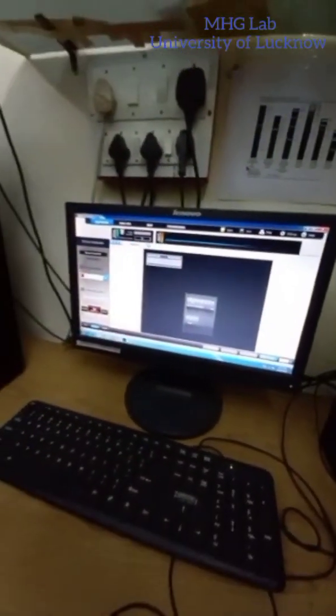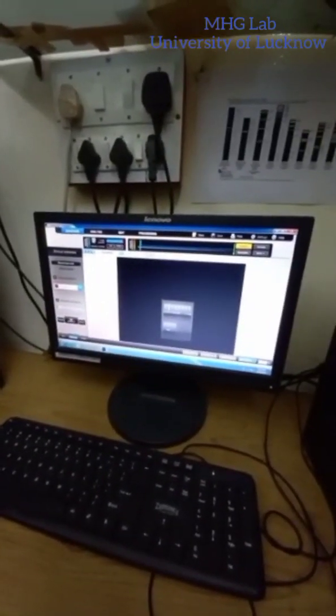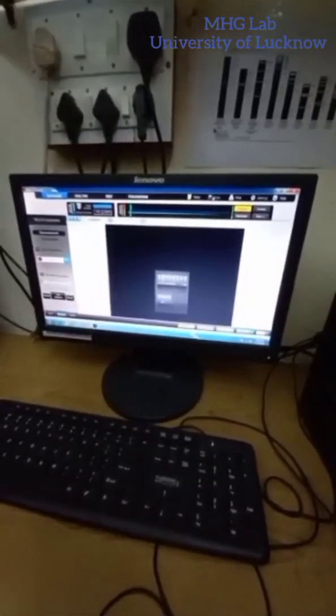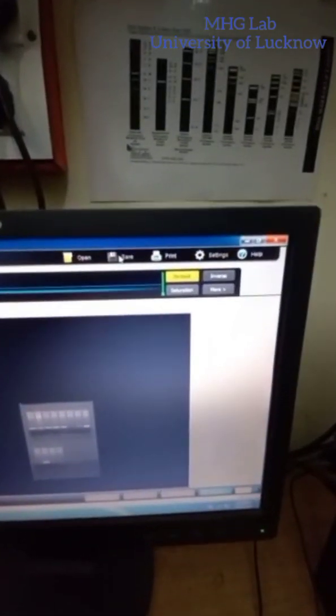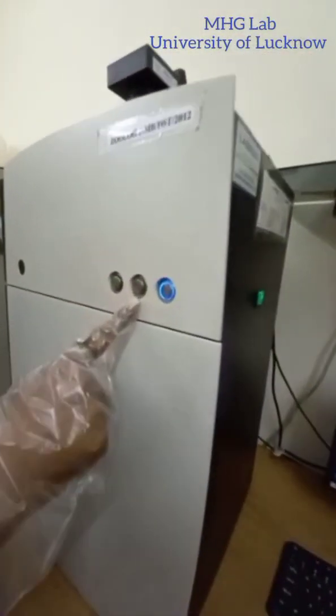So we will now stop that and we can save it for further reference in our computer. Now here is the caution sign if anything is wrong.